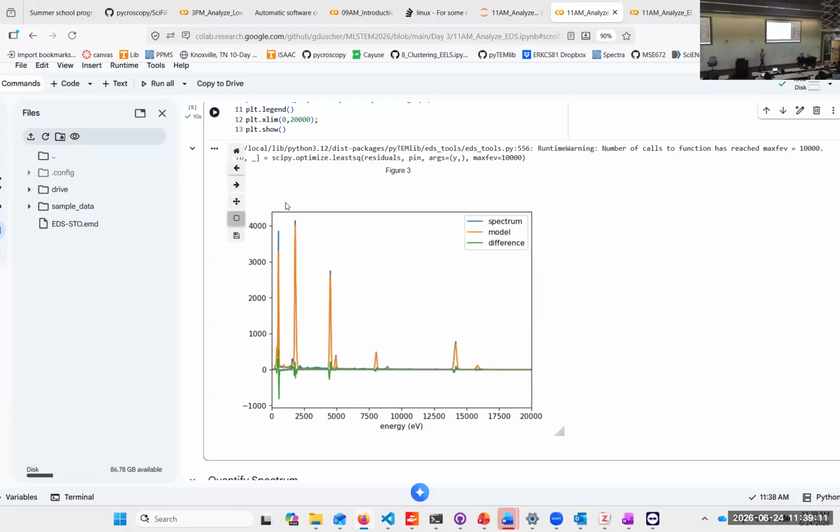So what that fit is giving us is overlapping peaks are not a problem, because I'm not fitting a single peak. I fit the whole family. And there might be one peak overlapping, but not the whole family directly on top of each other. That does never happen, right? At least it didn't come across to me yet. So that's odd.